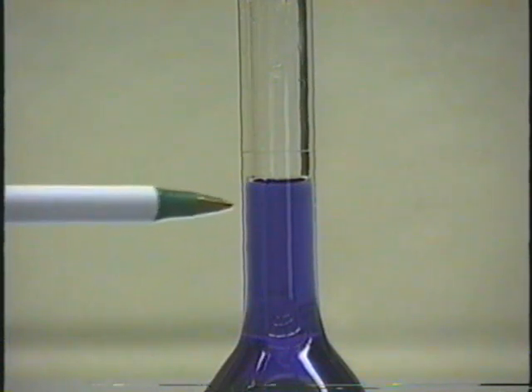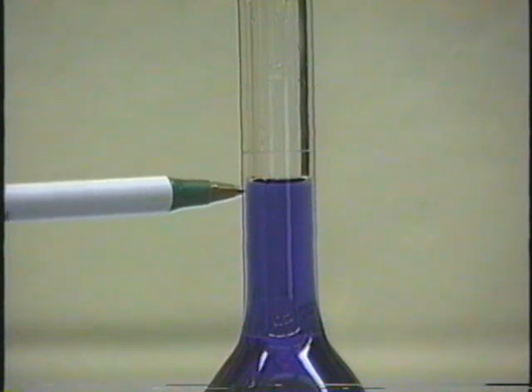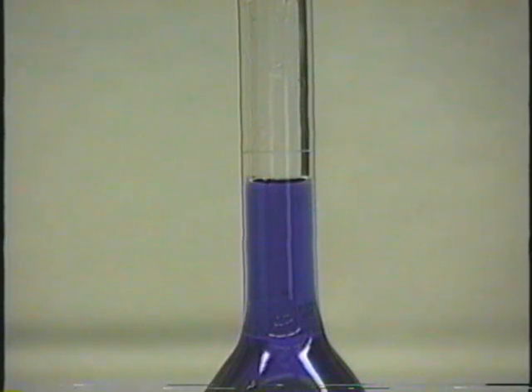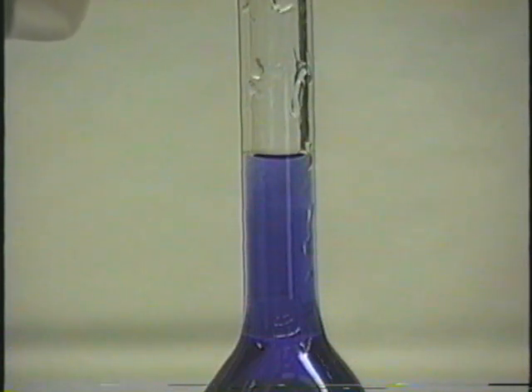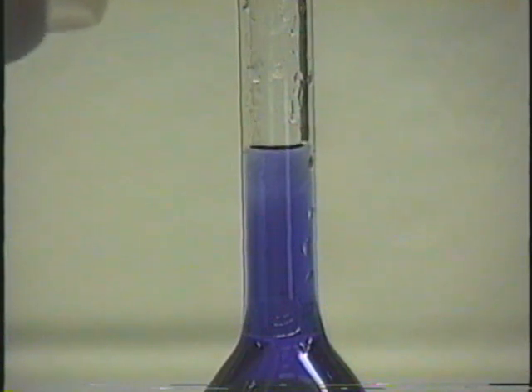Now, you'll fill it up with room temperature distilled water to just below the mark, and then add the distilled water dropwise until you get it just to this mark over here. The bottom of the meniscus should be just at that mark. There you go. It's right at the mark.